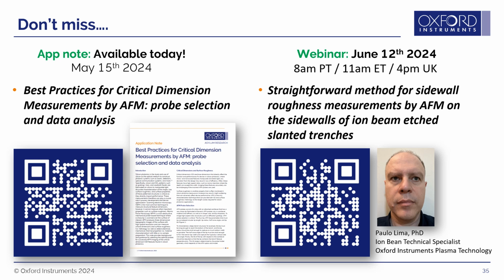Okay, great. So there's a couple of questions about scan speed. Do you need to scan slower when imaging trench features? You probably want to slow down in comparison to imaging a perfectly flat surface, just because you want to make sure you're preserving your tip, so you give it a little bit more time to react to very high features, very deep trenches, for example. It doesn't mean that you have to go extremely slow, but a little bit slower. For example, if you would image a perfectly flat wafer, you would probably scan easily at 5-10 hertz. If you're imaging trenches, you probably want to slow down to 1-2 hertz, so that you have a little bit more time to react and preserve your tip.